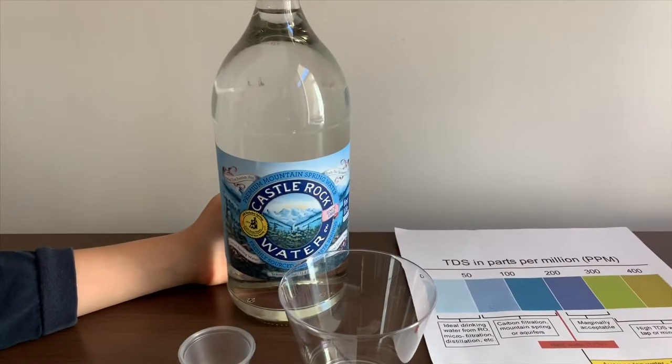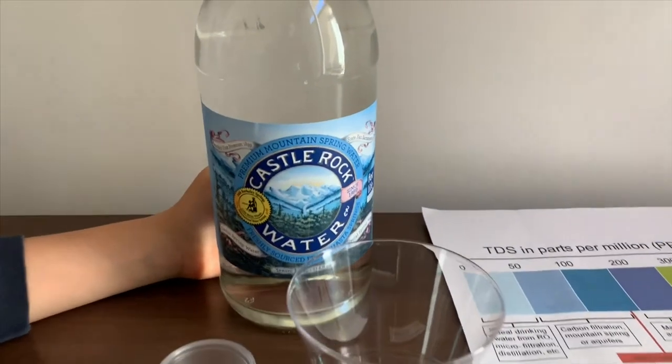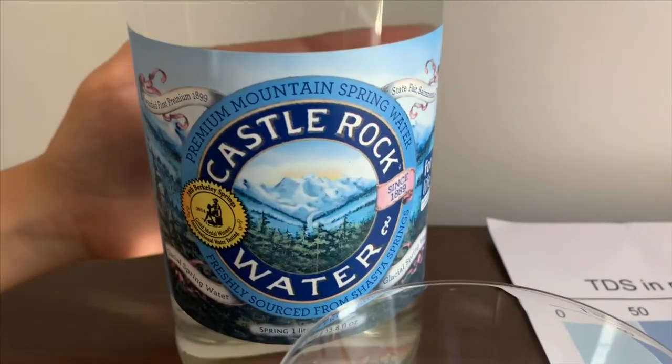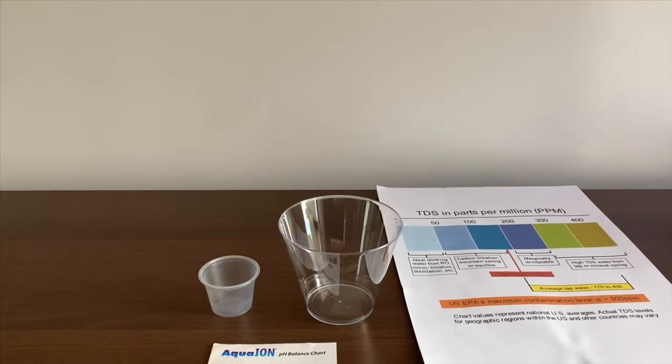This is Castle Rock Spring Water. It's sourced from Shasta Springs, California, and it costs $2.99. Let's test the pH and TDS now.